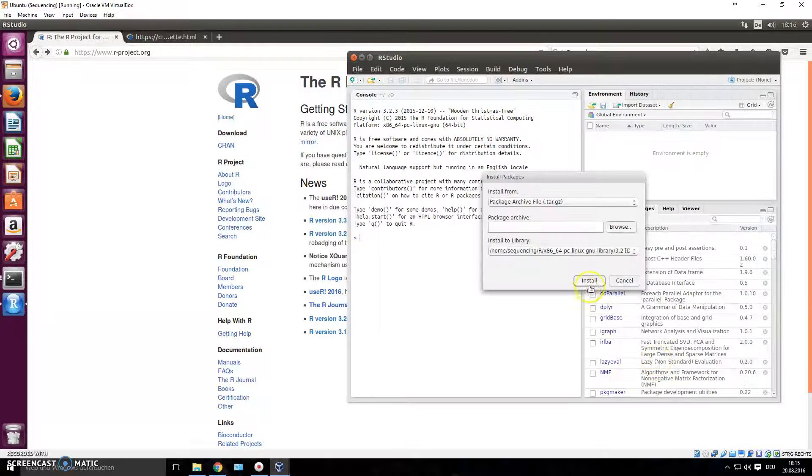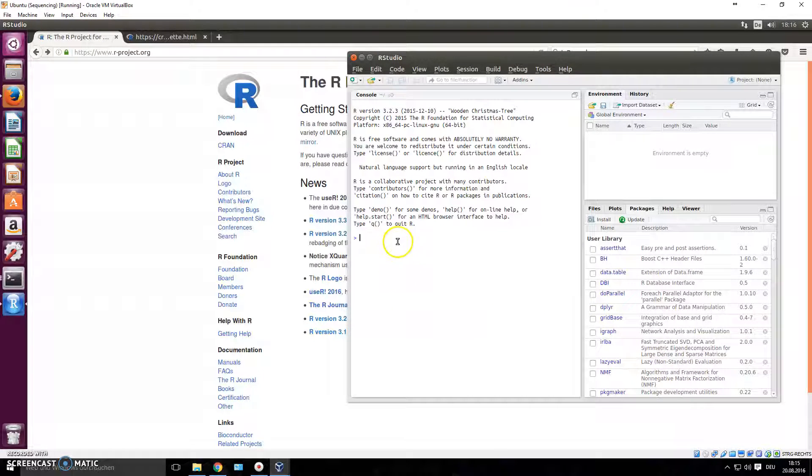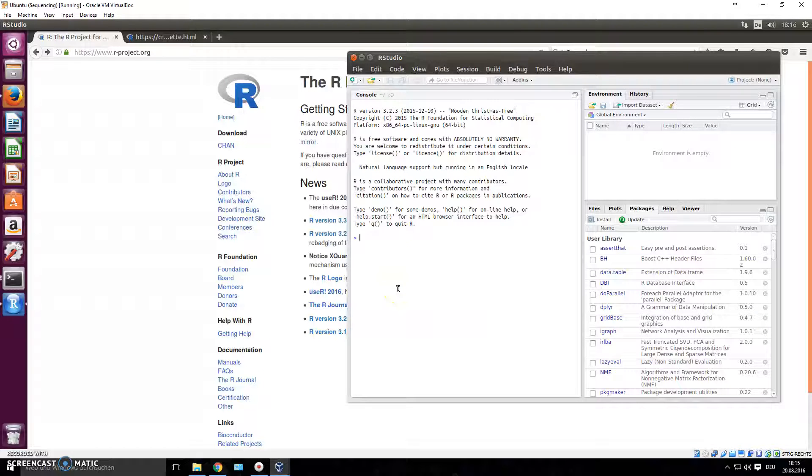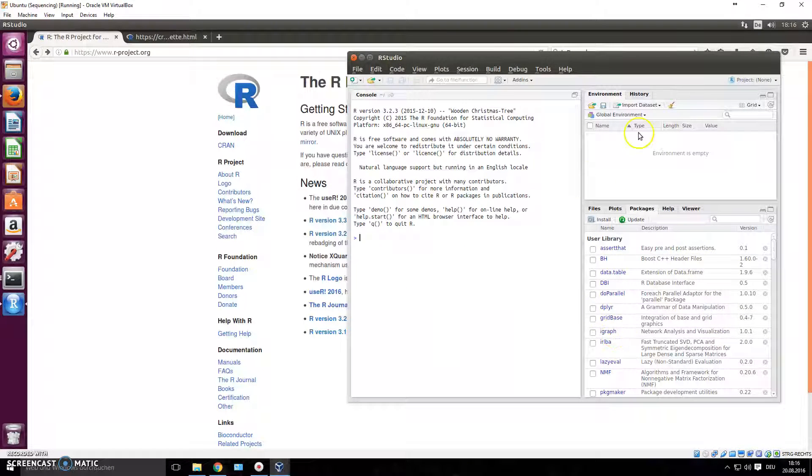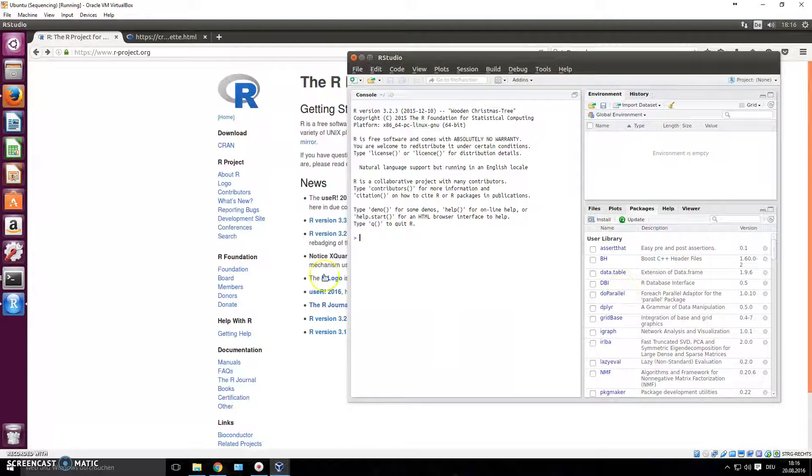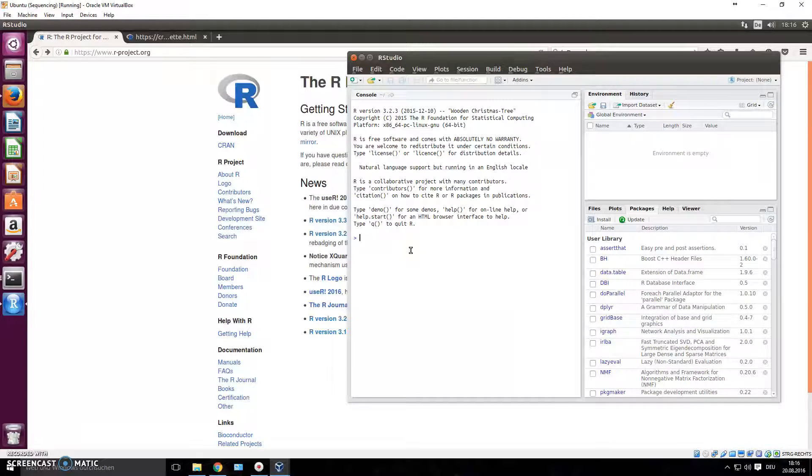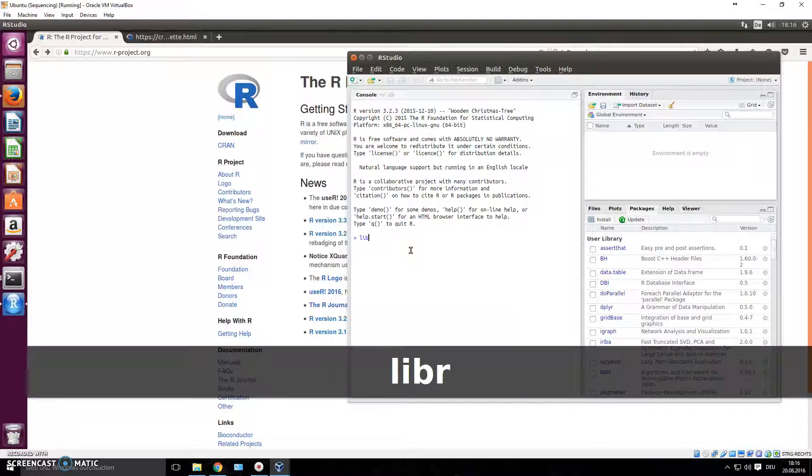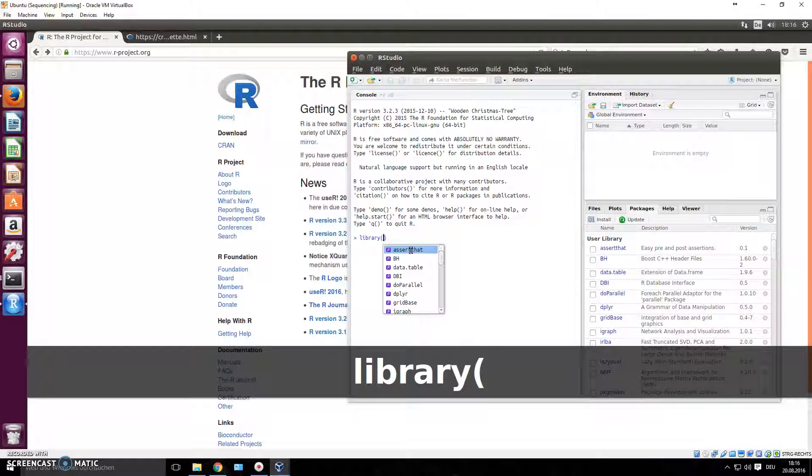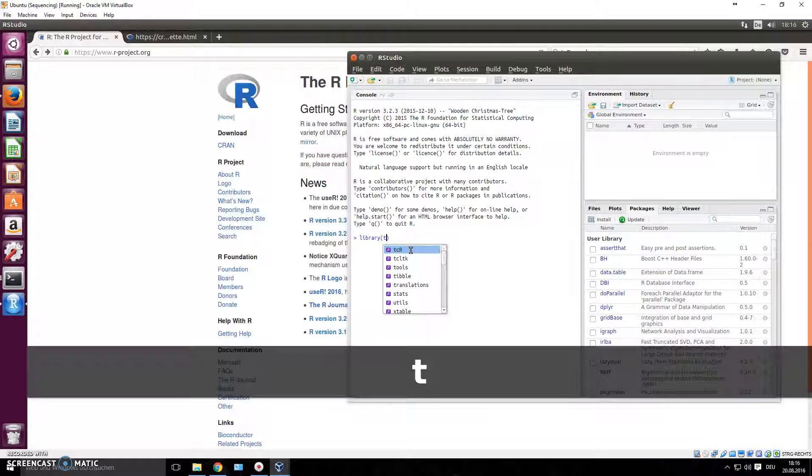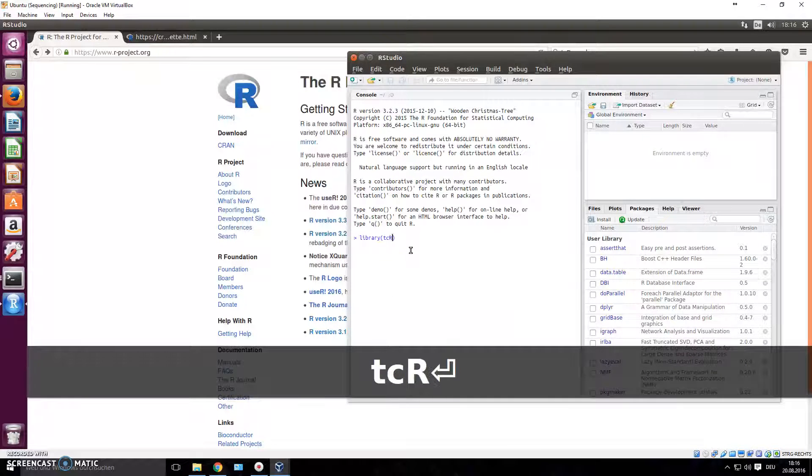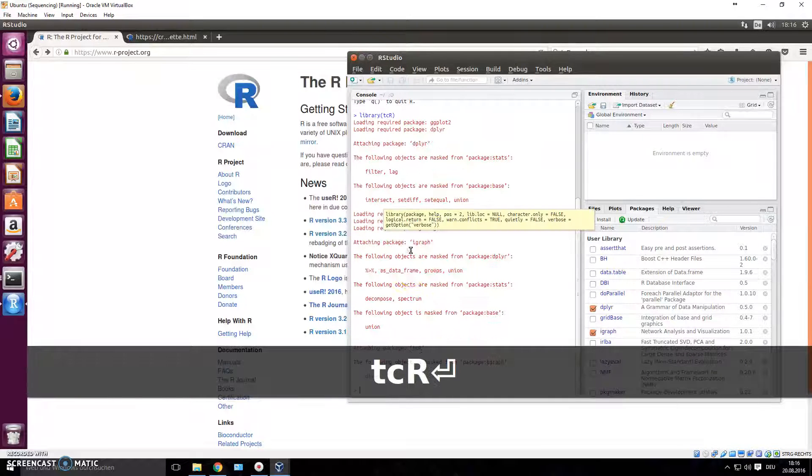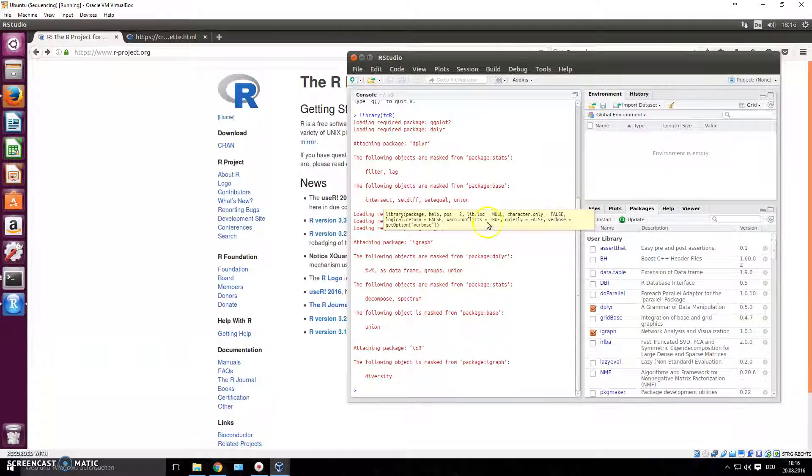Once you've installed tcR you can now load the library. You have to load the package - whatever packages you want to use in this session you have to load it. You can load it by checking the box here, or you just write library, open brackets, close brackets, you don't have to use quotation marks this time, you write tcR.